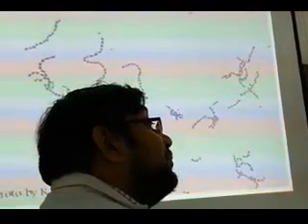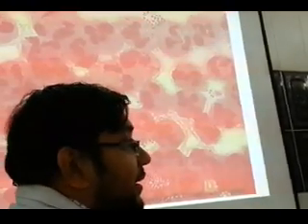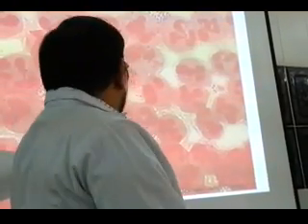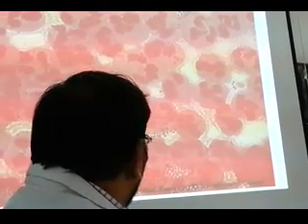Sir, this one is Gram-positive, this one is negative. This is negative. Now, bacteria. This is bacteria? Oh, good. This is RBCs. MashaAllah. This is the good thing about hematology. This is RBC. Yeah, see, RBCs don't have a nucleus.